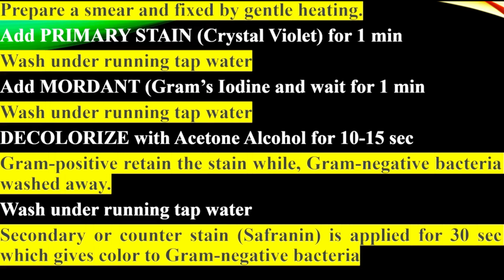The slide or the smear is decolorized with acetone alcohol for 10 to 15 seconds. In this step, what we get is that gram positive bacteria retain the color of the primary dye while gram negative bacteria are washed away. After that, wash under running tap water again.